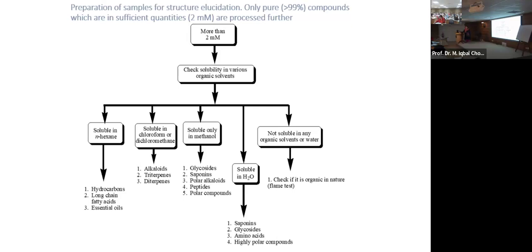But we do not have ethyl acetate. For example, it's a common solvent, but we do not have it deuterated. You need to check the solubility.